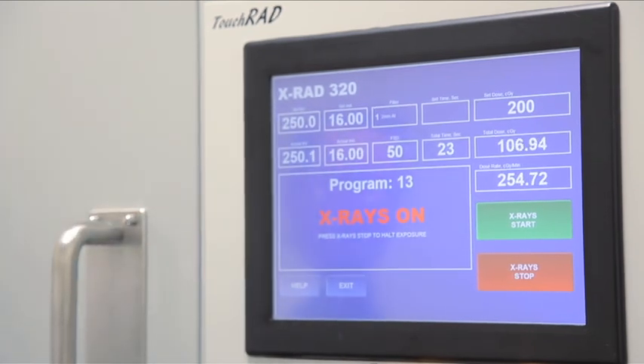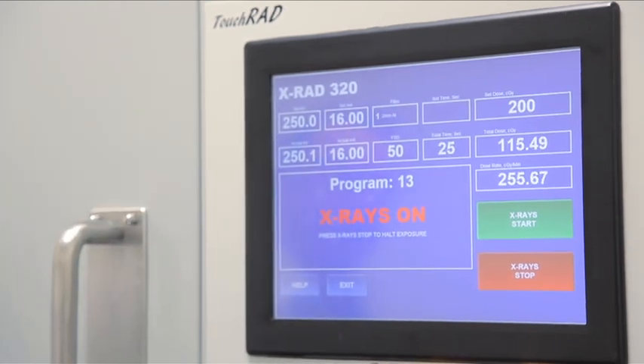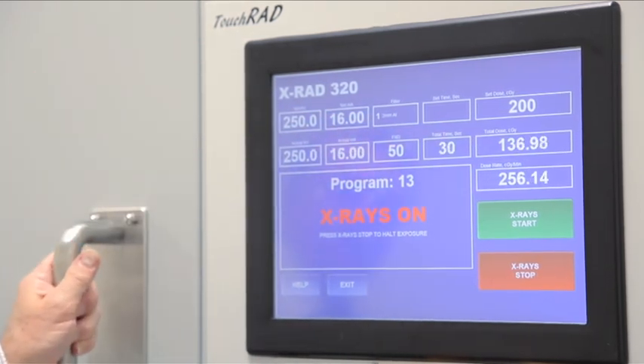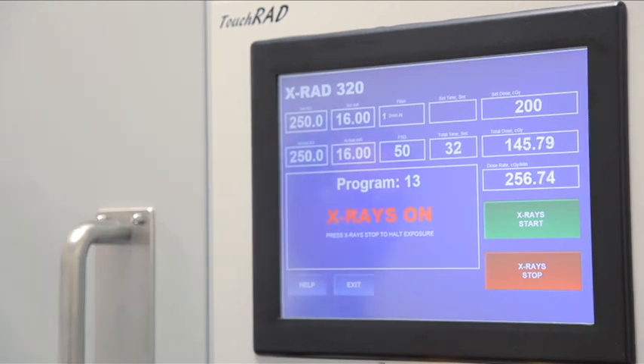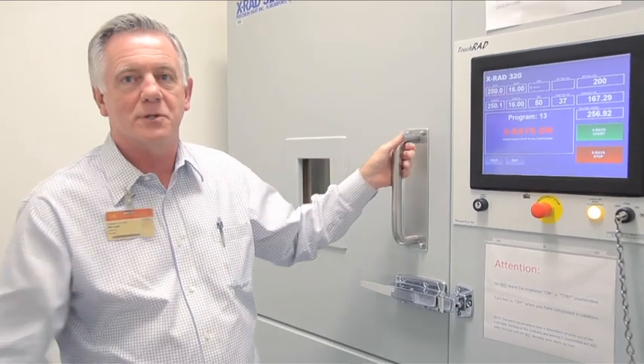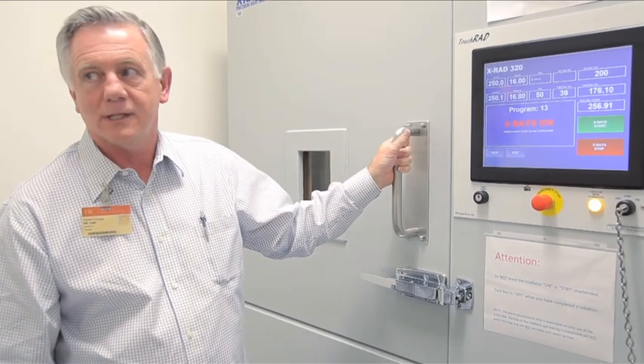It has an ionization chamber built in that's measuring the dose for you, and that's been calibrated against a standard chamber that we use for actually calibrating the machine at least once every six months.